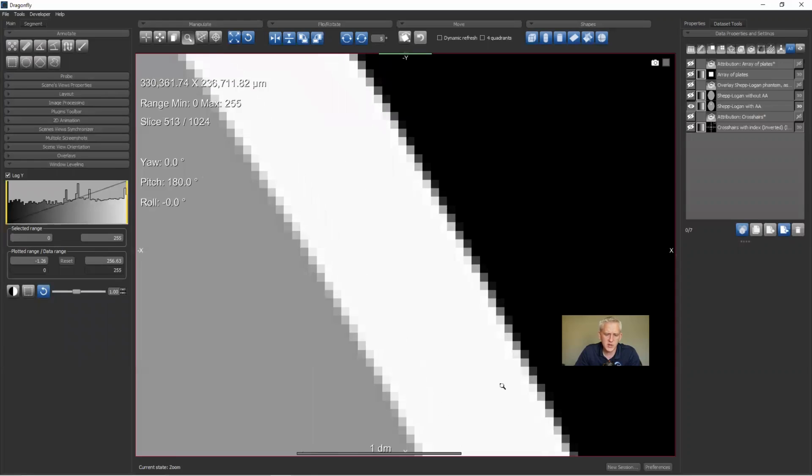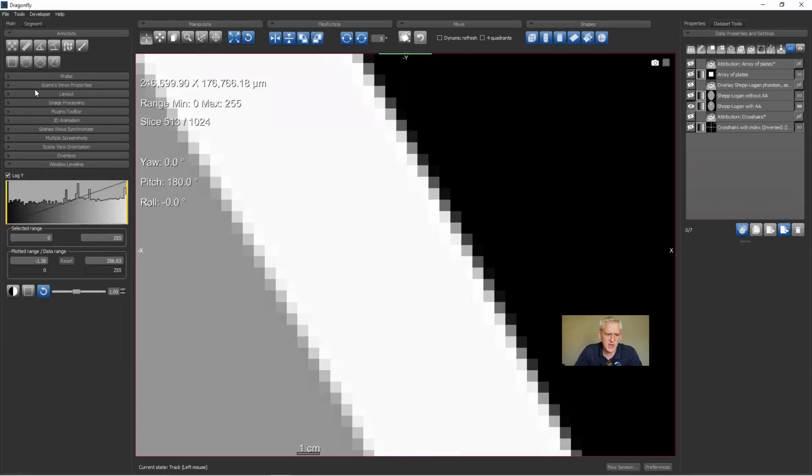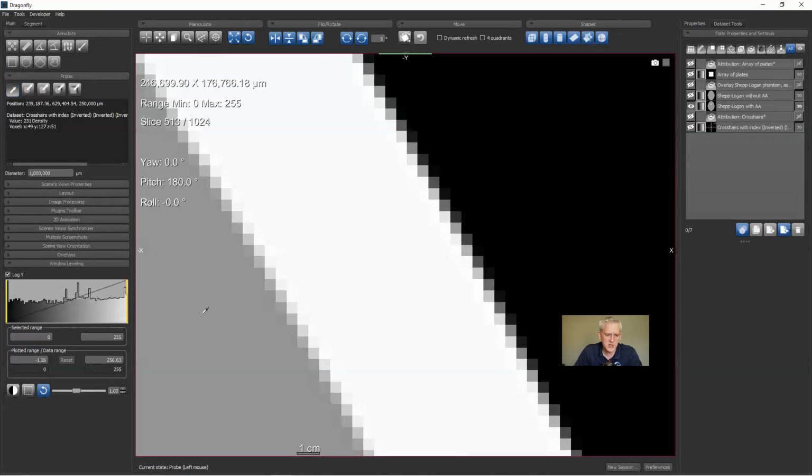Now, if you look at these pixels, you can see, if I were to do a probe once again, that over here they have an intensity of 150. Over here they have an intensity of 0. Here it's 250. So 150, 250, 0. But you'll also notice that the pixels on the interface are somewhere, in this case, in between 250 and 150. So you see this pixel is 232, and this pixel is 158, and this pixel is 148. It's weird that that's 148 instead of 150. But so you have this gradual transition.